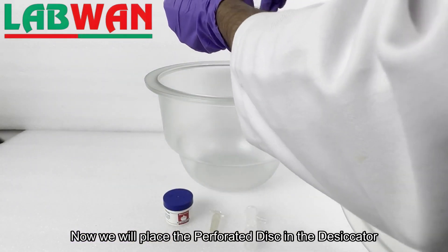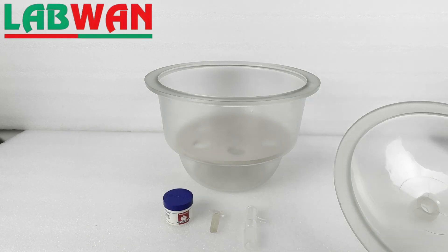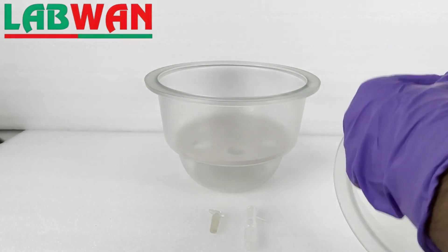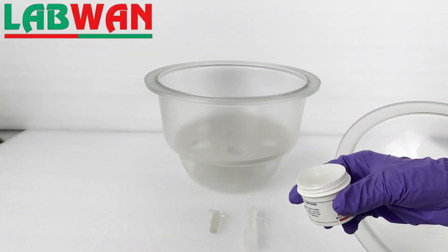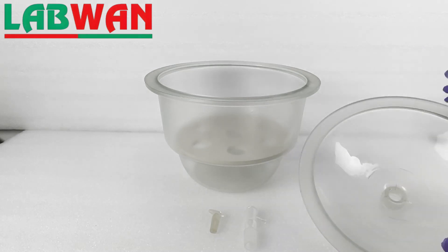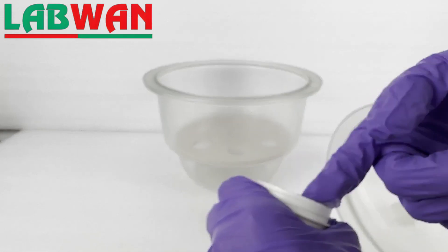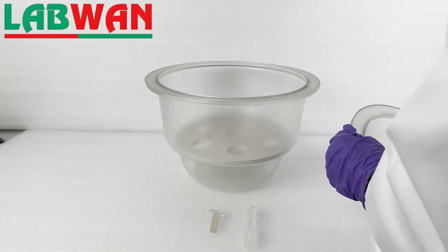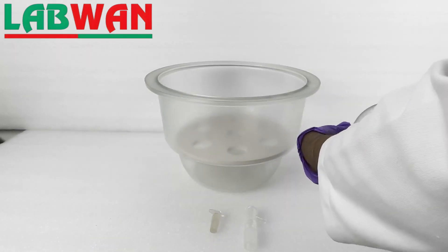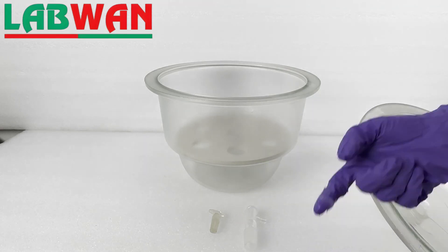Now we will place the perforated disc in the desiccator. We will apply the sealant grease to the desiccator lid for a secure vacuum, and then place the vacuum seal.